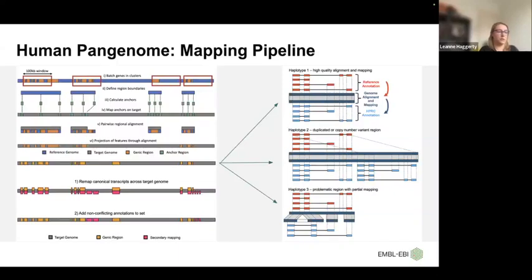But of course, there are other scenarios. In scenario 2, this is where the alignment software begins to struggle. This can happen in regions that have large structural variability, such as copy number variations, segmental duplications, or long repetitive regions. Or simply where the sequencing quality in a particular haplotype might be lower, although with these latest consortia, assembly quality is just improving. So this is not so much of a problem anymore.